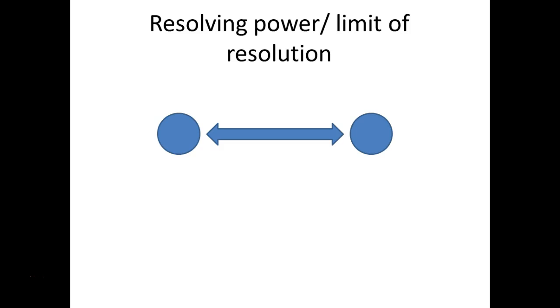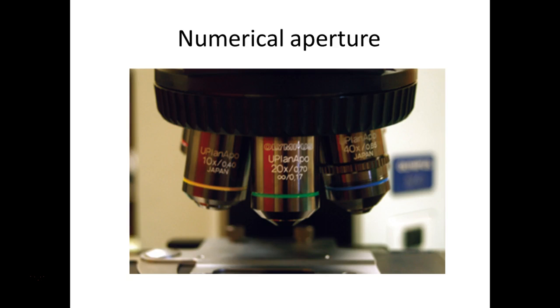Make sense? I think they have three different kinds of lenses in a light microscope. I think it's 40x, 10x, and 100x, right? Yes, yes. Okay. Yep. So that's my next slide. There are several different lenses we call objective lenses.